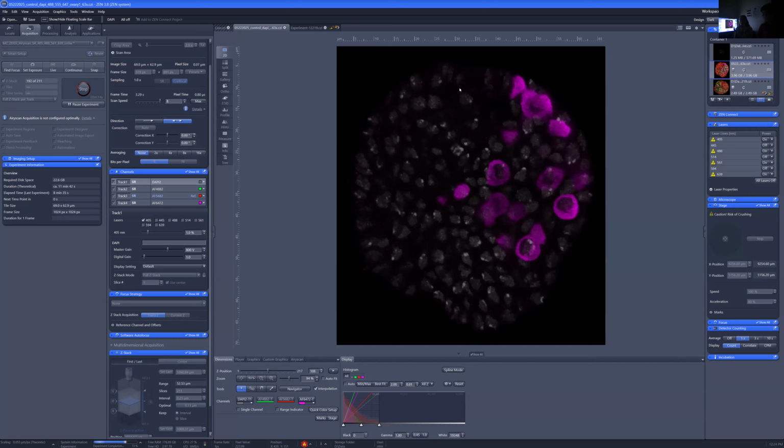And so this has been a really good investment in this collaboration with this imaging specialist who works in my building. He put together the analysis pipeline for me, and then we worked together to improve the imaging to make the images really clear and crisp, so the computer program could basically see them better. We've been working together for about 1.5 years now, and I now have a very nice analysis pipeline that I can run myself.